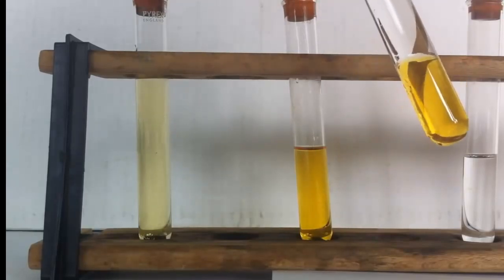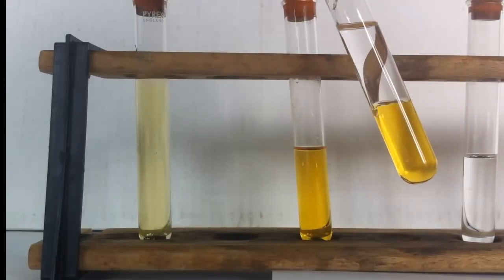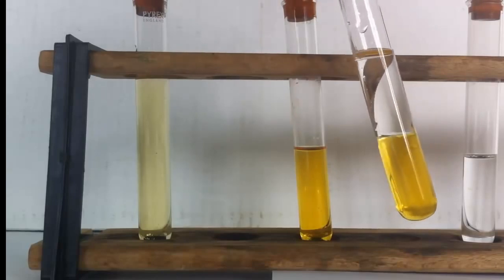So at the moment we've got the bromine water on the bottom. That's an aqueous solution of bromine. And on the top we've got the cyclohexene.